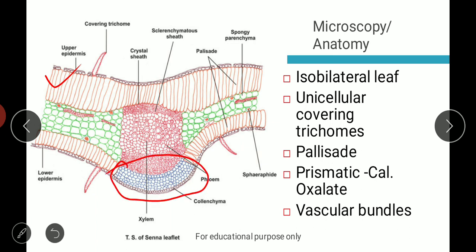In the mid-rib region, instead of palisade cells there is collenchyma. The palisade is observed only in the lamina portion. The intermediate region contains parenchymal cells, in which we observe sphaeraphides — calcium oxalate crystals. A crystal sheath (clarenchymatous sheath) is observed in the mid-rib region. The phloem and xylem vascular bundles are at the center.